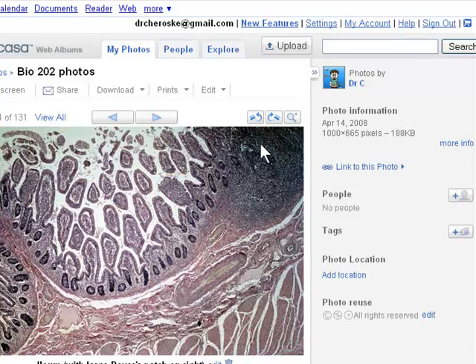There's going to be white blood cells in there, etc. So the presence of a Peyer's patch is going to tell us that we're looking at the ileum as opposed to duodenum or stomach, okay? In fact, there's two ileum slides. One that just says ileum, another one that actually says Peyer's patch on the slide.